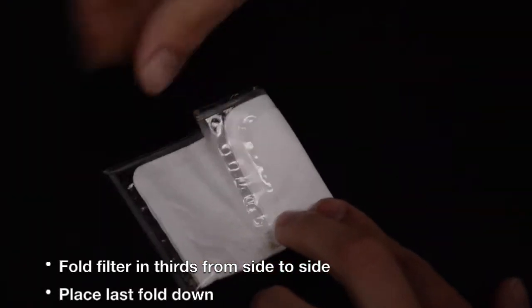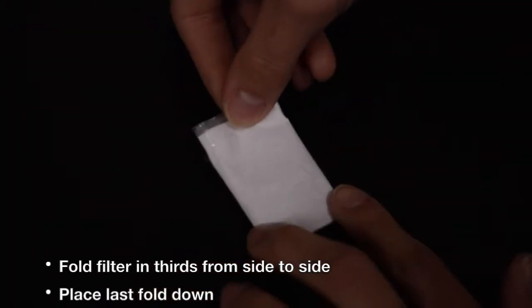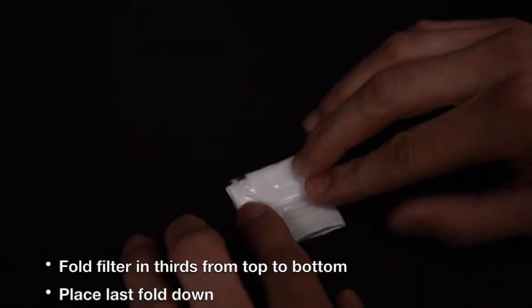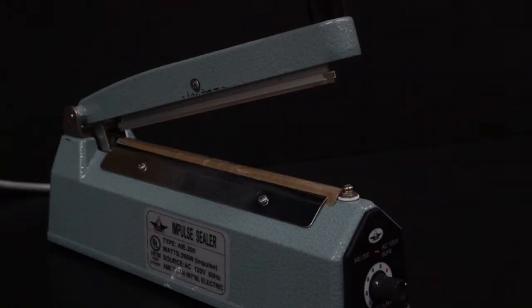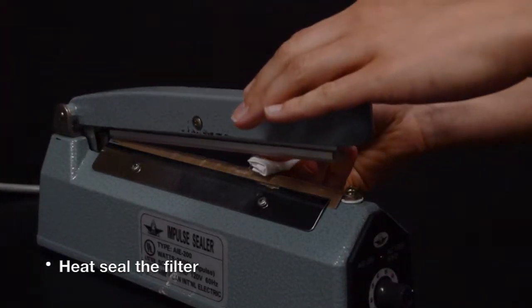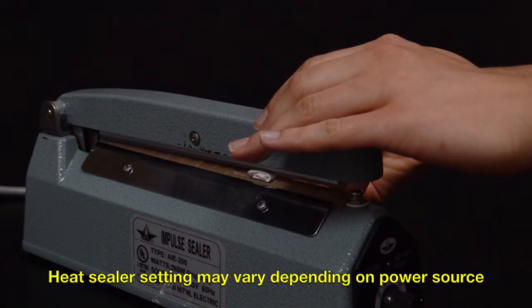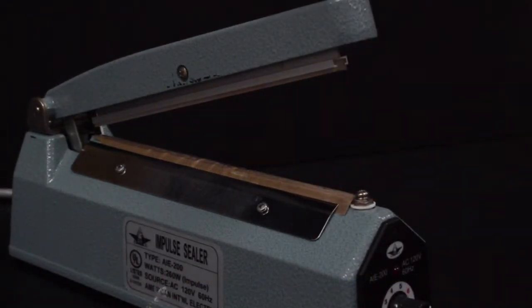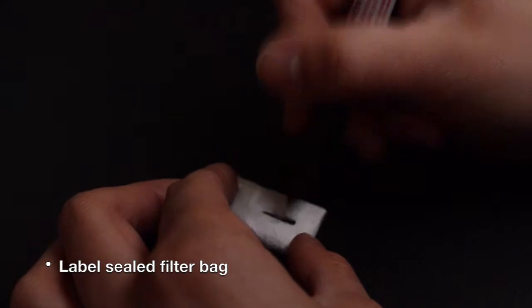Fold the filter in thirds from side to side, and place the last fold face down. Fold the filter in thirds again from top to bottom. With your heat sealer set to 6, place the exposed polypropylene material from your final fold onto the heat sealer. Press the arm of the heat sealer down. Release the arm three to four seconds after the red light goes off. Re-seal the bag if necessary. Label the folded sealed filter bag.